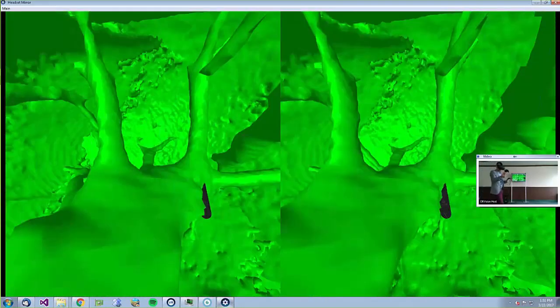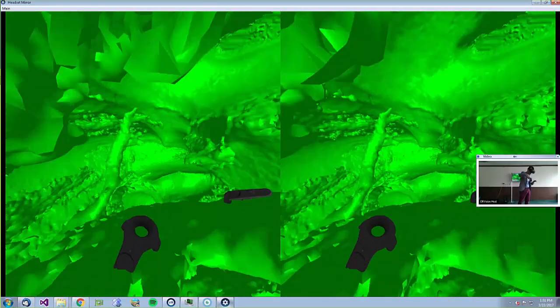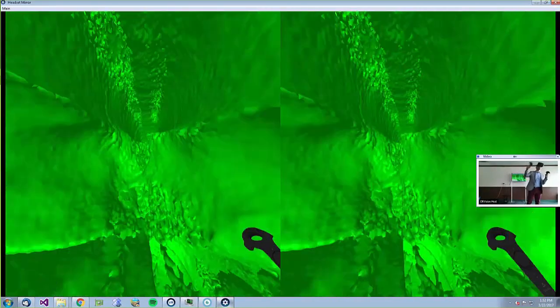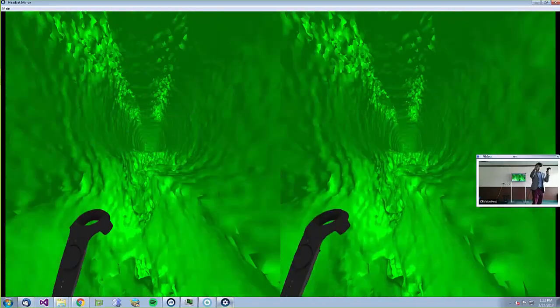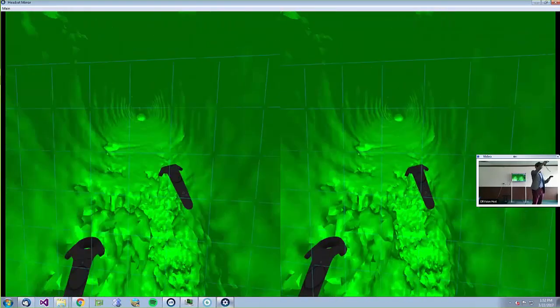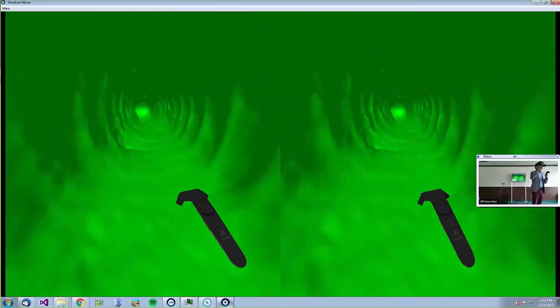Yeah, I'm trying to come back here. Okay. So I think that is backbone. Yeah. So this way is backbone. So I'm going down, and naturally backbone then connects to the tail, and that's where I'm in right now.